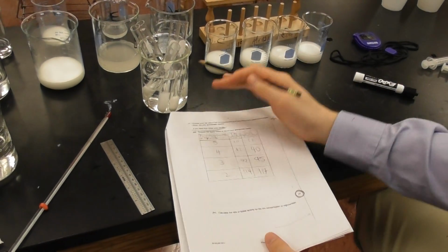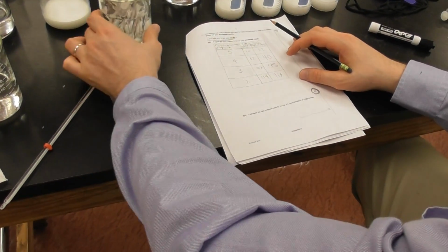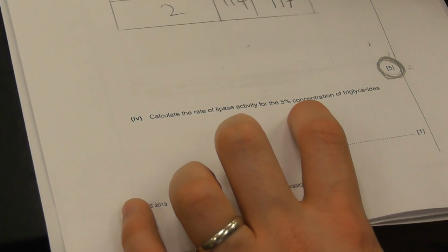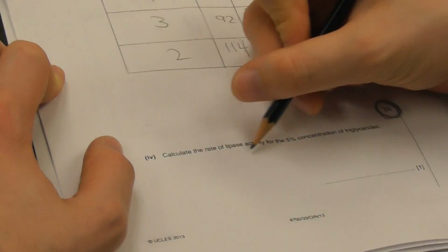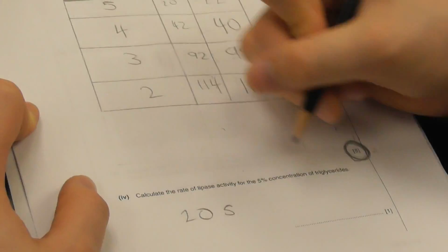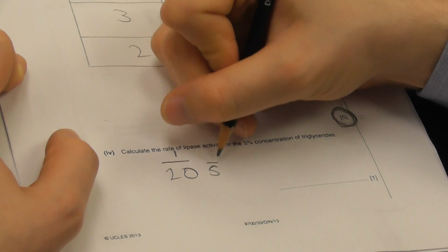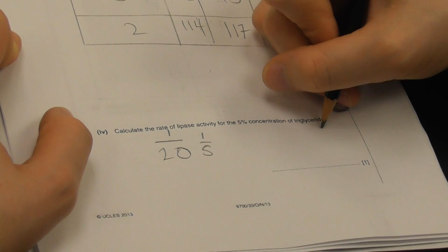Okay. All right. Now, as far as calculating the activity of lipase goes, here's how you do that. For the 5% concentration of triglycerides, it took 20 seconds. Done.